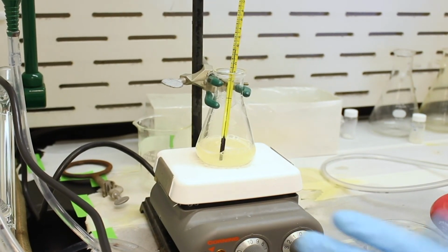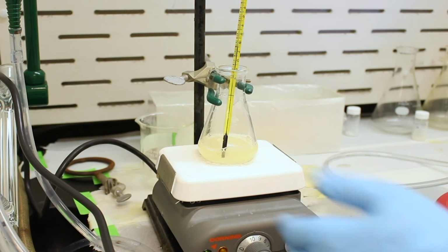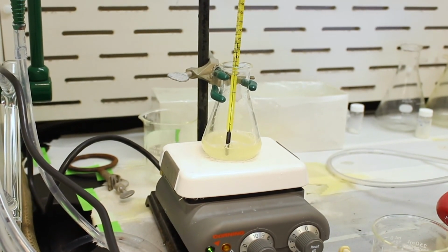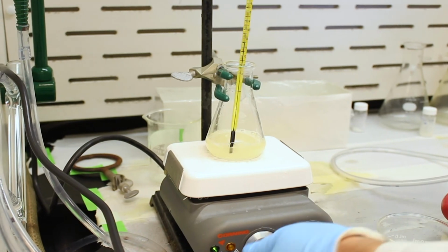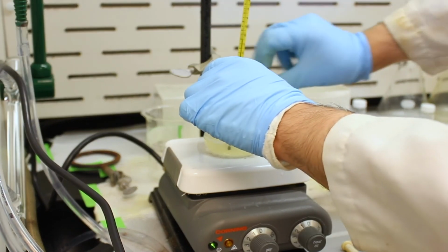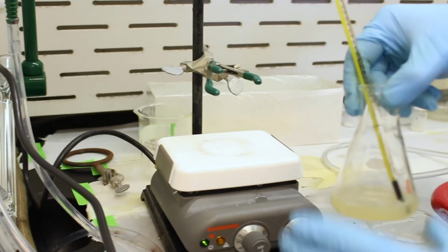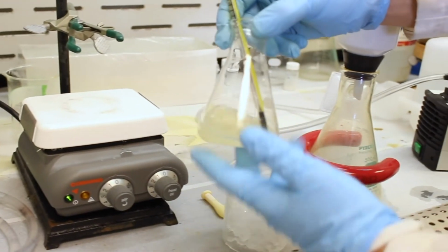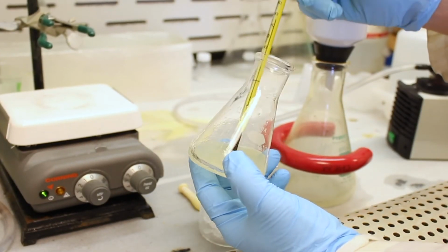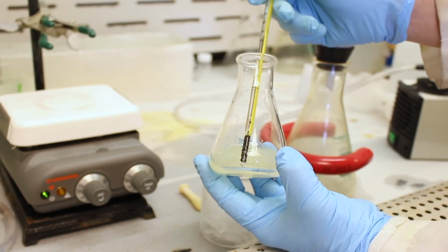Okay, all right, so we've allowed it to come up to room temperature. The temperature is now about 15, 17 C, and it's been stirring for about 15 minutes. So the reaction should be complete. As you can see, it's still all pretty much homogeneous. There's a little bit of air bubbles because it was stirring so vigorously.